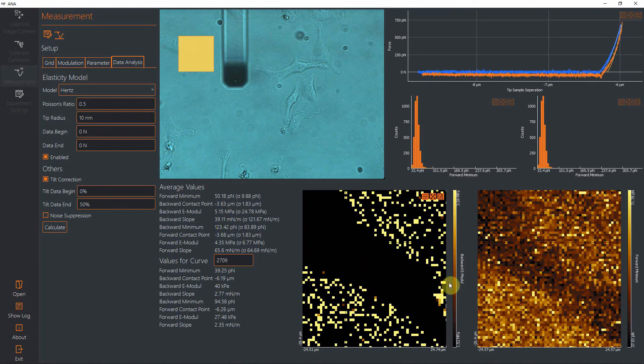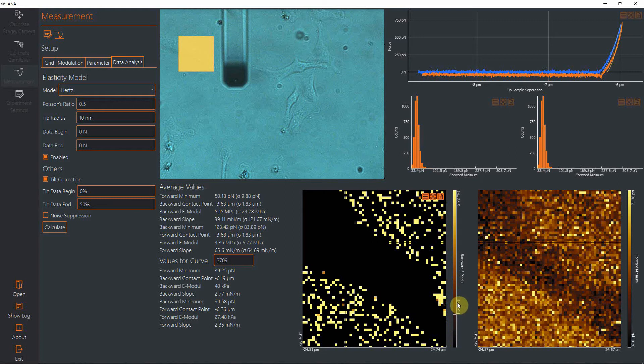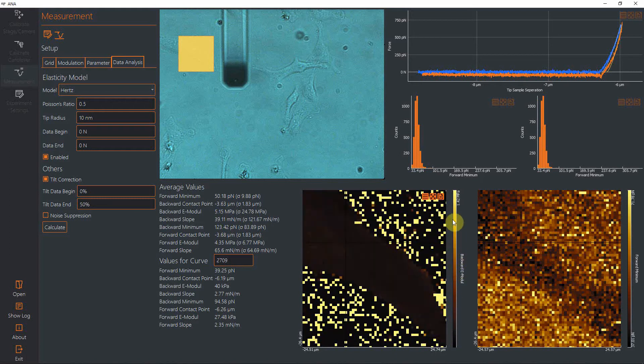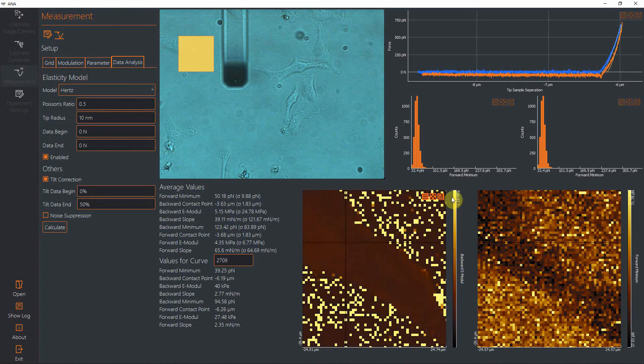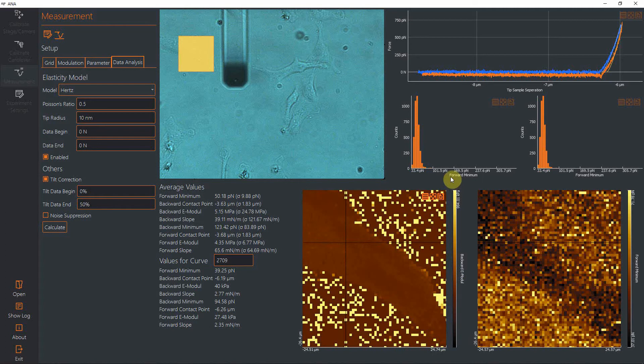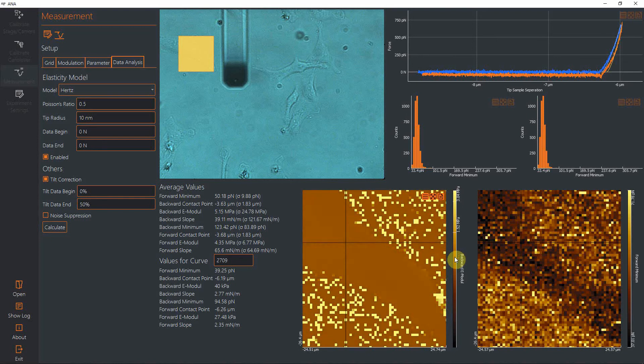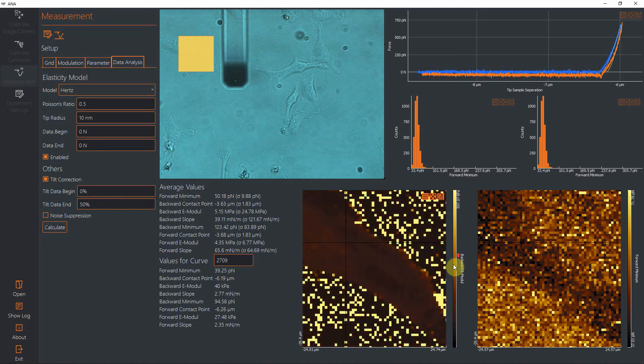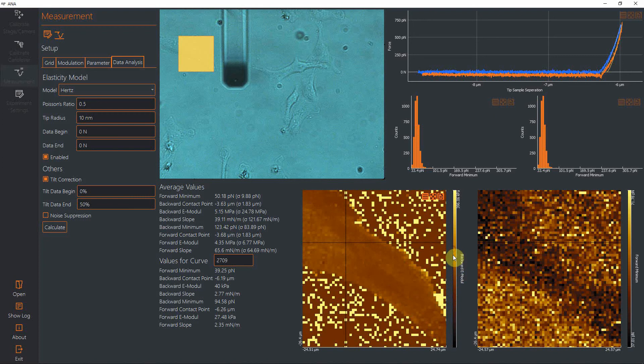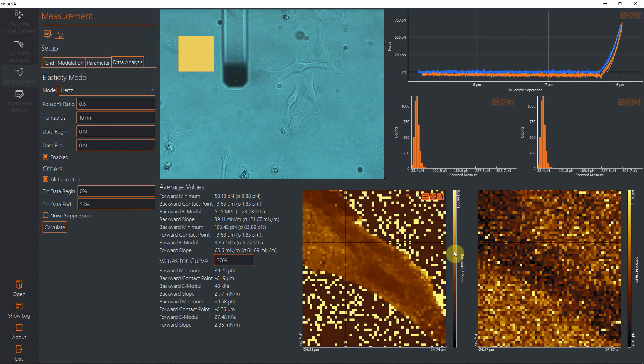Since the glass is very stiff, there are some outliers, and also the curve here seems to be—that dark part is saturated. You can change the color scale by clicking and pulling here on the bar. You can change the range, the offset, and you can change the range simply by scrolling. Down here you can make details in the cell more visible.